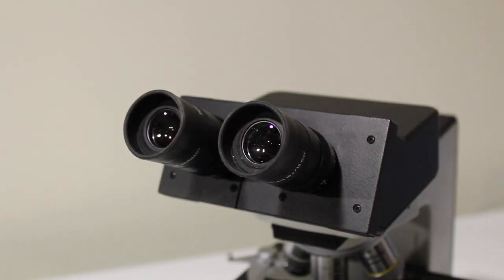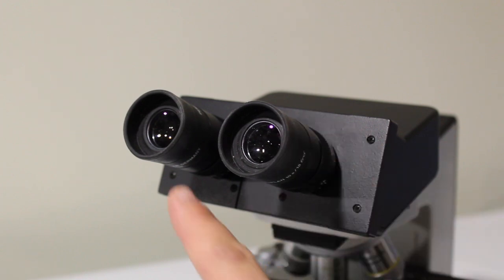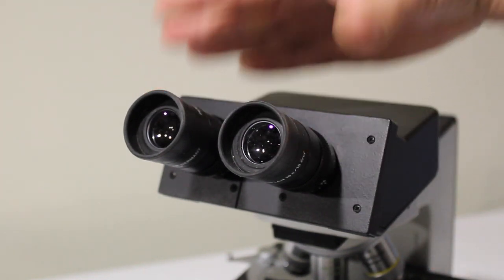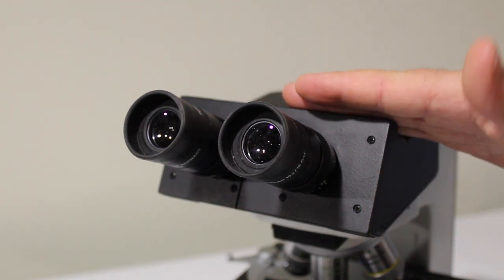The final destination for light traveling through your microscope is the headpiece, which is what contains the ocular lenses, which are the lenses you actually look through with your eyes. Headpieces tend to come in three major forms. What I have here is what's called a binocular scope because it has two lenses. If you're doing a fair amount of microscopy, this is what I'd recommend because it's the most comfortable to use.